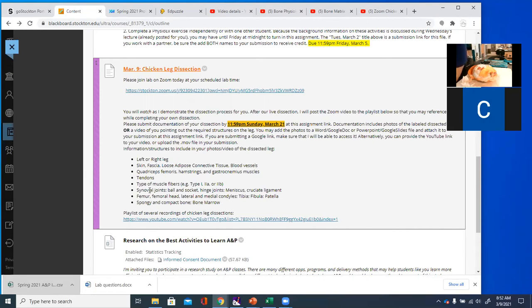Any movable joint is called a synovial joint. We're going to look at two of them — the ball and socket hip joint and the hinge knee joint. I want you to point out both types of joints, and specifically the meniscus and a cruciate ligament within the knee. I'll also ask you to point out the femur, the condyles of the femur, the tibia, fibula, and patella. At the very end, I'm going to ask you to actually break a bone to look at the bone marrow and spongy versus compact bone.